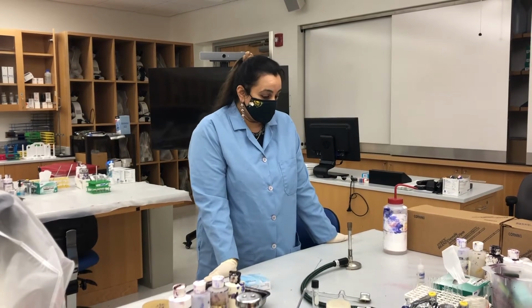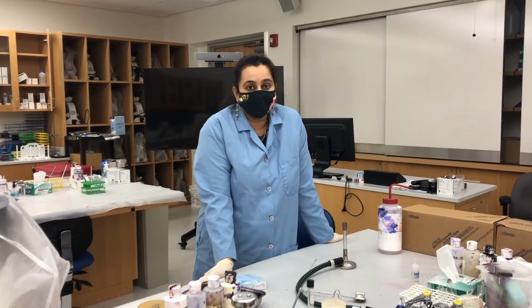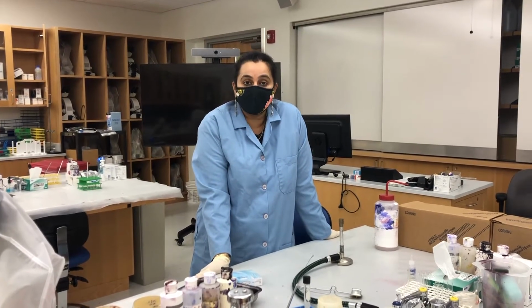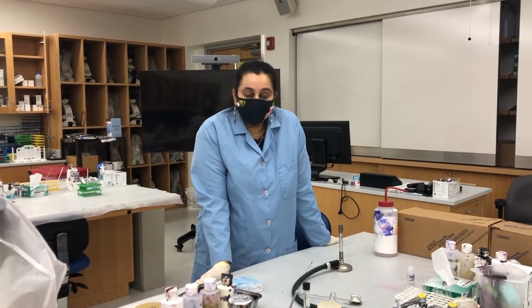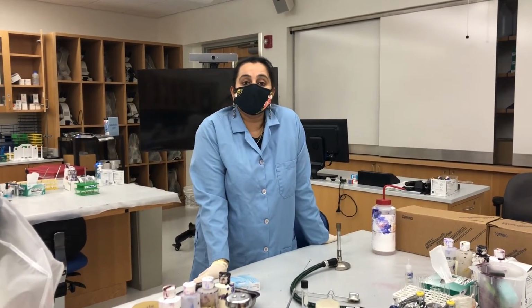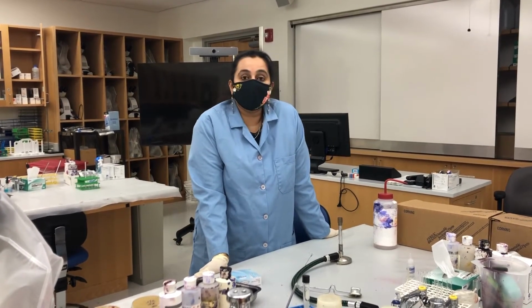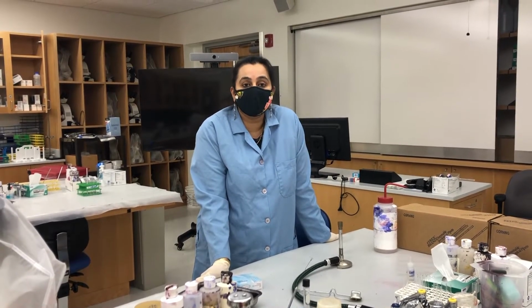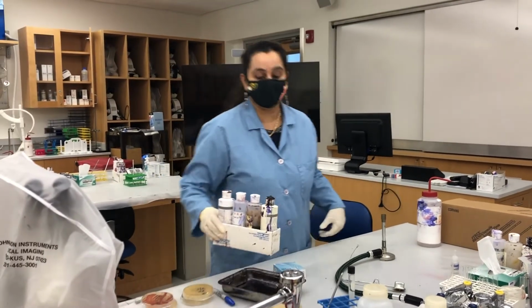Okay, so I certainly suggest, I highly recommend, and you must watch all the videos that have been uploaded on Canvas for the second lab exercise. Apart from that, you also should pay close attention to the procedures. I will be showing the demonstration now of the gram staining technique, but it's really important for you guys to understand why each and every reagent is added in the procedure.